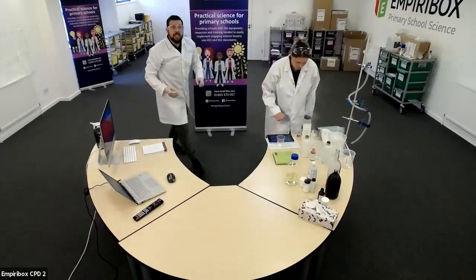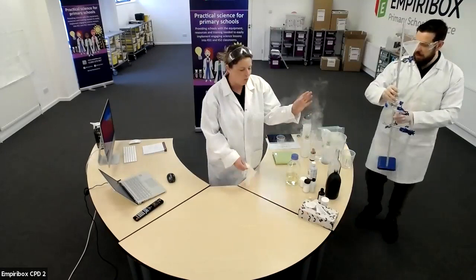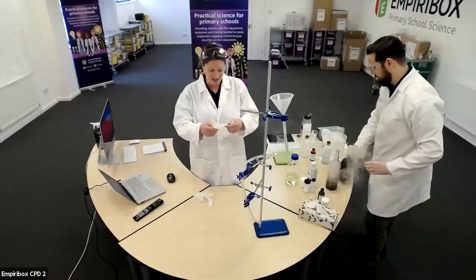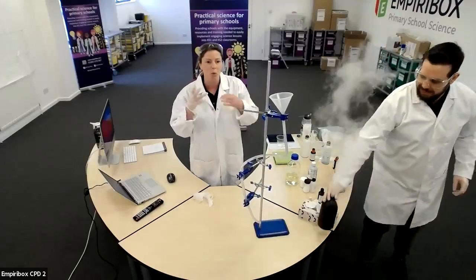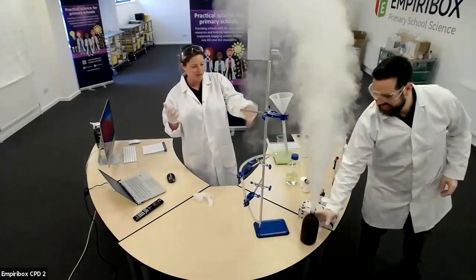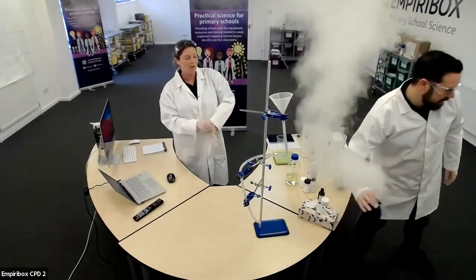All right, Sarah, are you going to show them the next one? Absolutely. So what Chris has just talked about there is that we can tell a reaction has taken place because we're looking for one of those telltale signs. And there we go. It's going all over the place, look. We can see, wow.